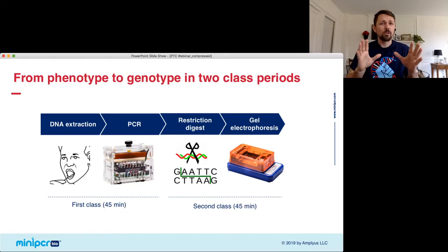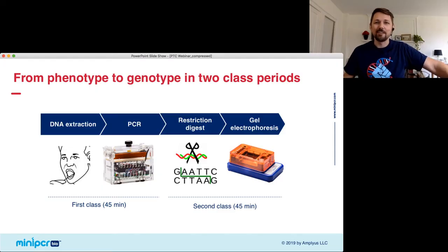Just so you know, I'm going to be doing a little bit of the cooking show version of this, where I'll be demoing it and then hitting a little fast forward, especially on the PCR stage. That takes about an hour. We're not going to wait an hour for the PCR to run.